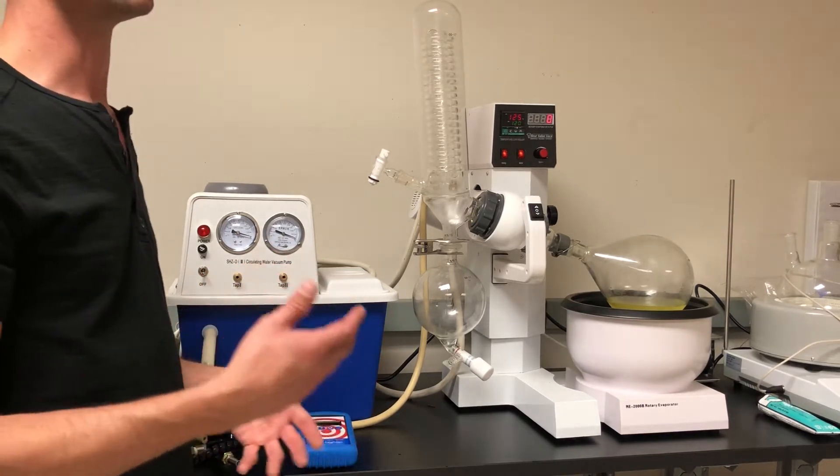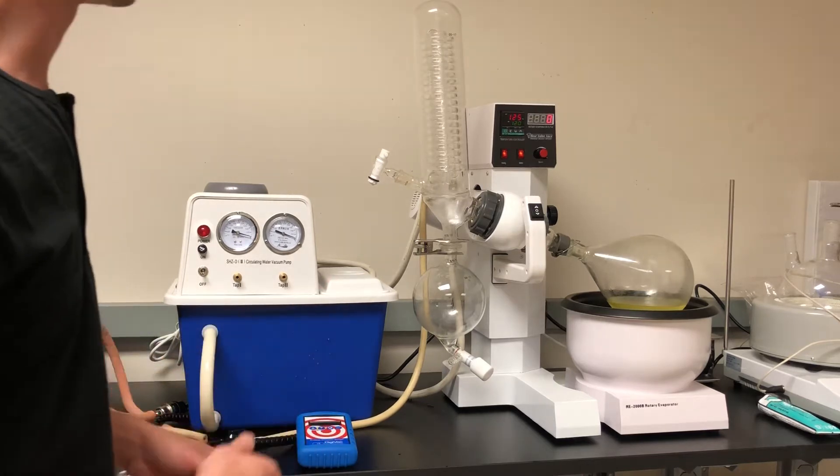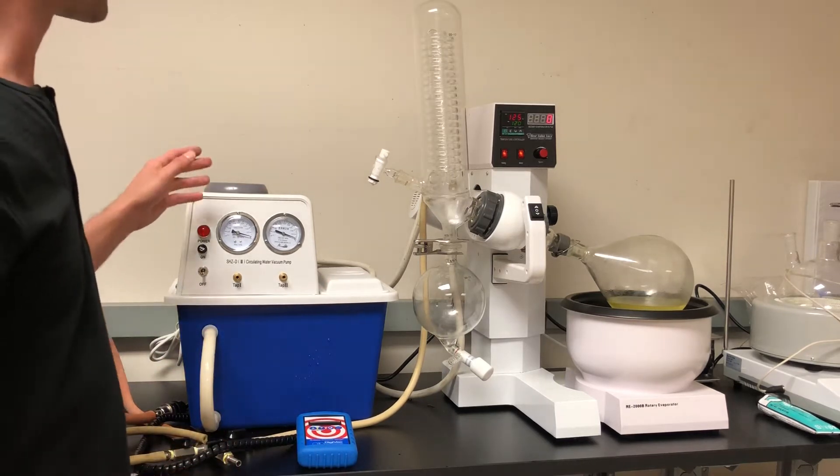So if you have to up your capacity, this isn't going to do it, you might as well just get a chiller. All right, so a couple of things I want to talk about.